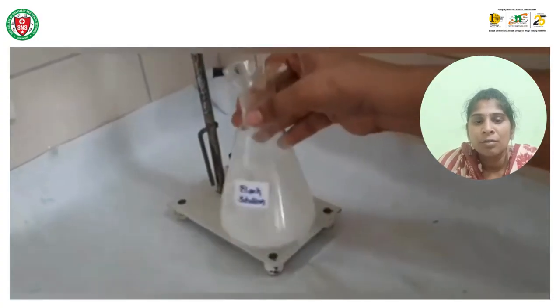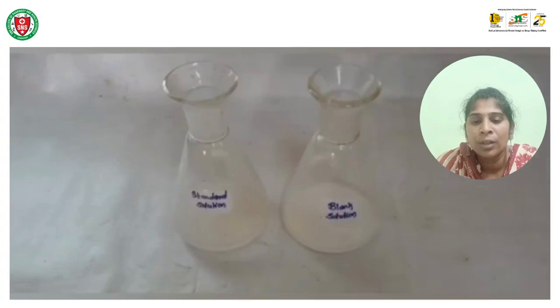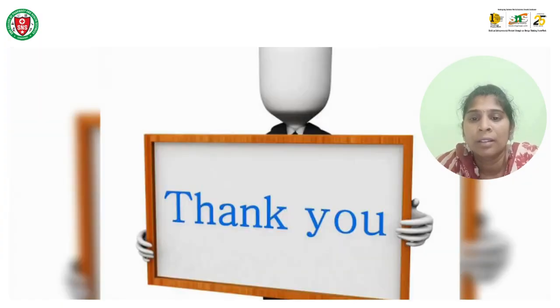The titration process was over, and after taking the burette readings of the standard solution and the blank solution, we are going to calculate the saponification value with the formula. B is the sulfuric acid volume for the blank. We took about 15 ml of sulfuric acid, and we got a value of about 178. So it falls into the range.